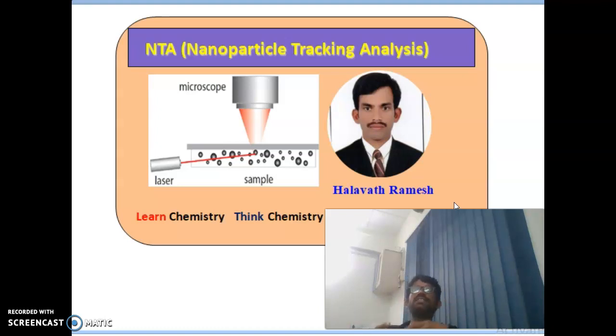So nowadays, especially in the research area, particle size measurement is a big challenge, and year by year the technology is updated, and particle size can be measured using advanced instrumentation techniques. I think nanoparticle tracking analysis is mostly used for biological sample preparation in the cosmetic industry, medicinal field and pharmaceutical industries.